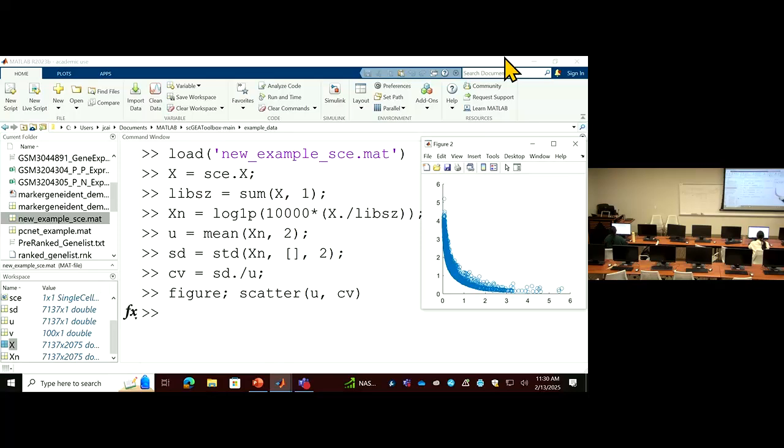And since there's a boundary here, there's no gene, even from a real, very noisy expression data set, that will be able to jump inside this empty region. There's some mathematical limitation that does not allow them to go into that region. So you do see a curve with a boundary here. I'm going to do a transformation in log, and then you see a straight line, and some of the genes jump away from the line. So let's do the log transformation figure.